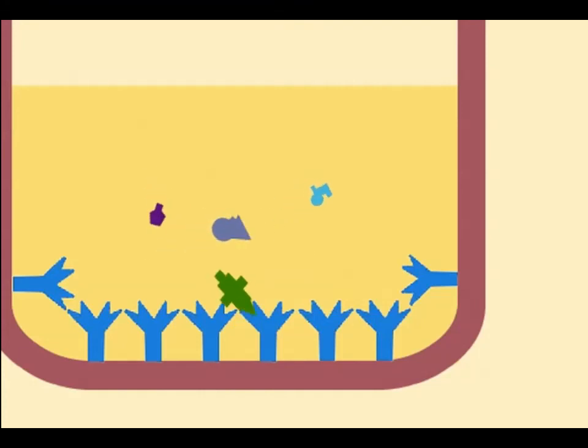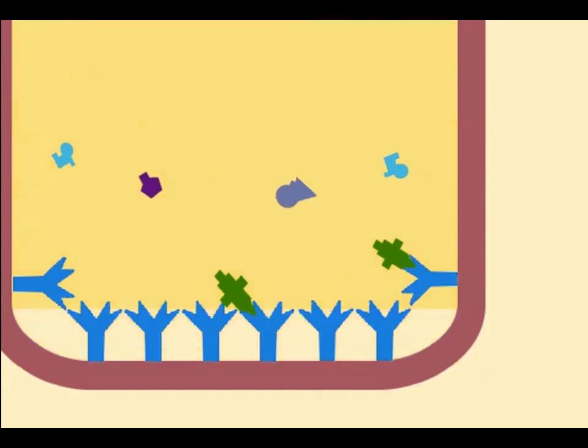In this example, the green shape represents the antigen of interest, and the other shapes represent other molecules in the sample. However, note that only the specific, or green antigen, and none of the irrelevant molecules bind to the antibody-coated wells. This accounts for the specificity of the test. The wells are then washed out to remove any of the unattached molecules, leaving the antigen of interest stuck to the wells. Now, a second antibody, directed against another epitope on the target antigen, is added.